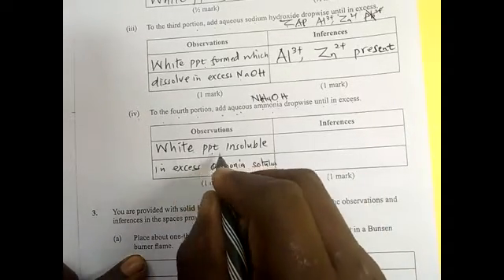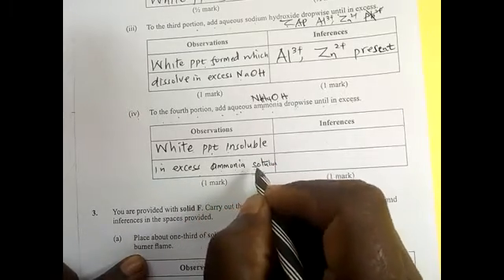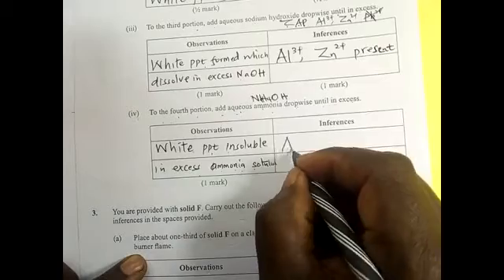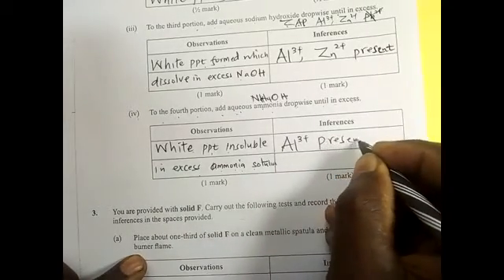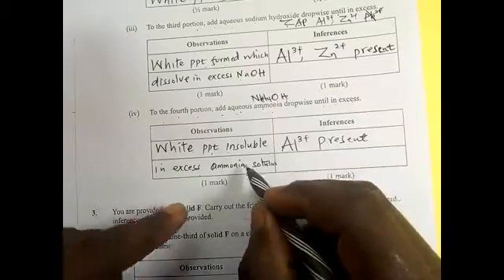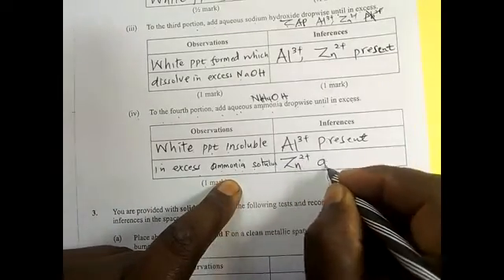A white precipitate is formed which does not dissolve in excess ammonia solution. Now that confirms that aluminium is present. Another thing that this one is telling us is that the zinc 2 ions are absent.